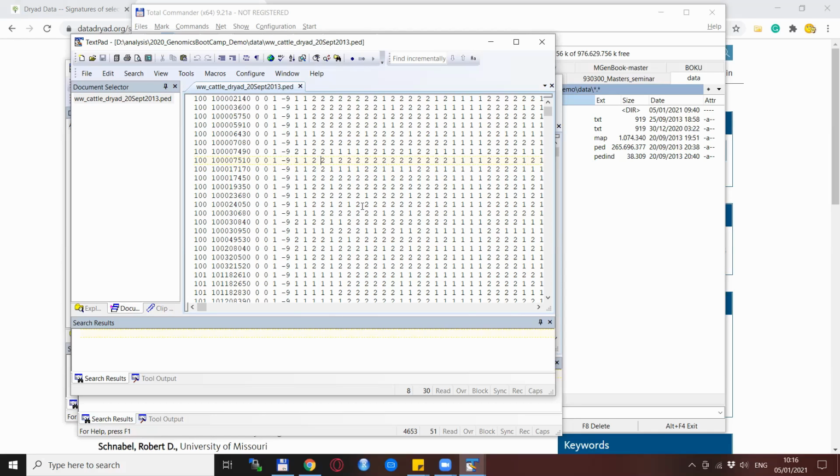That's why, after you receive the data, the first thing you need to do is open them and see what is in them by looking at the number of SNPs, number of animals, the coding type, and so on. Then you have a bit of a feel for what you have to work with. So this was it for now, just looking at the text files and the genomic data files. At some point we will also get to creating and manipulating all these large quantities of data.